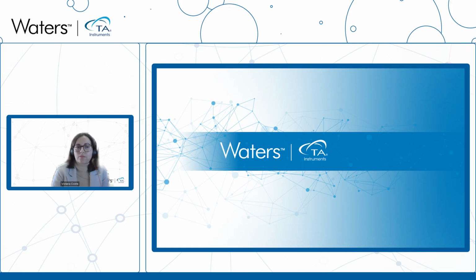You can also have loss of resolution for smaller magnitude transitions. DSC is a great technique because it provides great resolution, so it's easy to deconvolute and identify multiple peaks. Of course, you also get more information out of a DSC experiment since it's also measuring enthalpy. Plus, you can use it for different modalities without any concerns about molecule intrinsic fluorescence, for example.